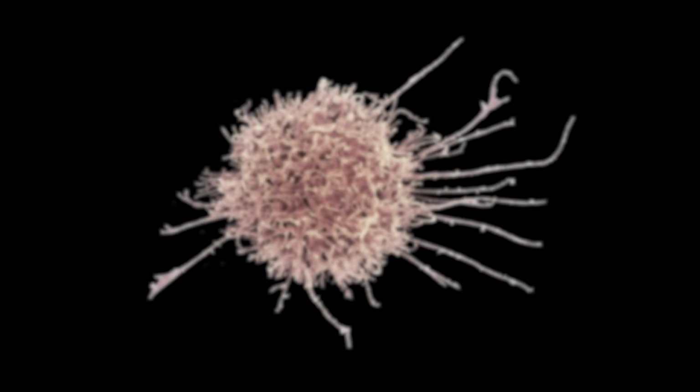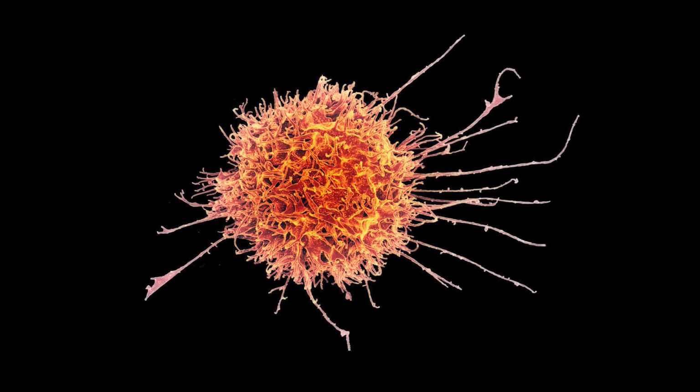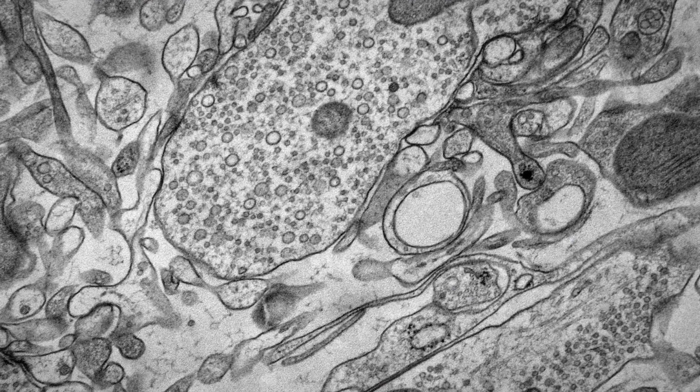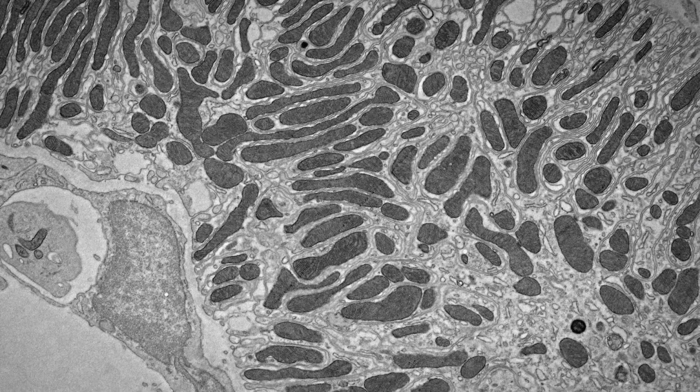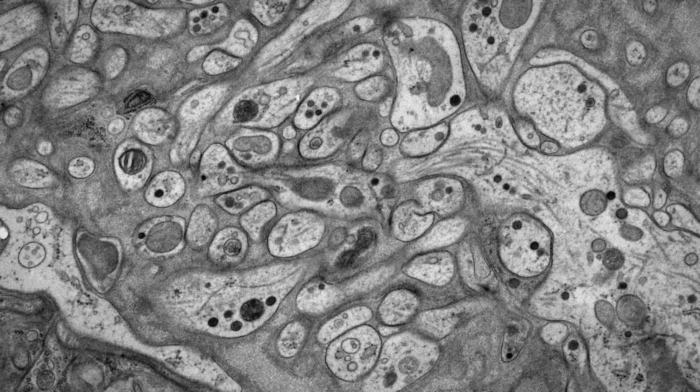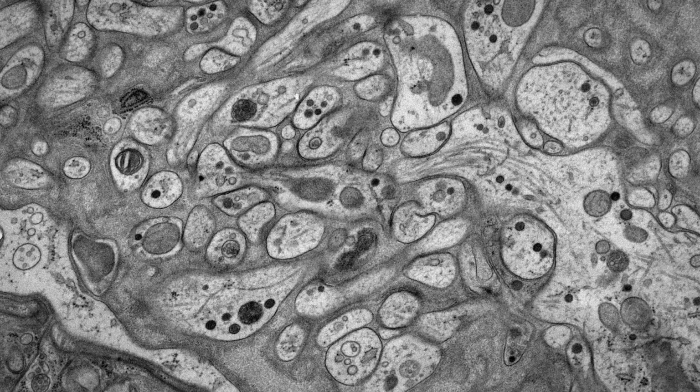The scanning electron microscope, as the name suggests, the beam of electrons scans the surface of the sample and gives us an image of the surface view. So it's a three-dimensional view of the actual object that you're scanning. In a transmission electron microscope, the electron beam goes through the sample, and that's where the image is generated by all the areas in the sample that allow your electron beam to go through. And this gives us a more detailed image of the inner structures of a sample.